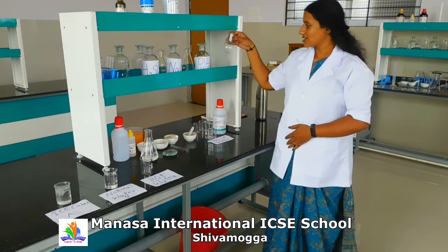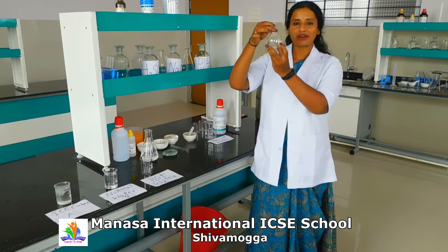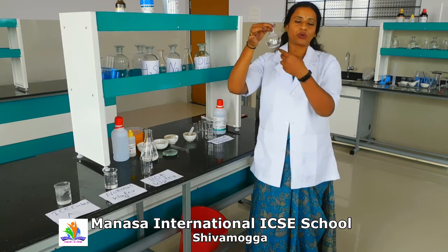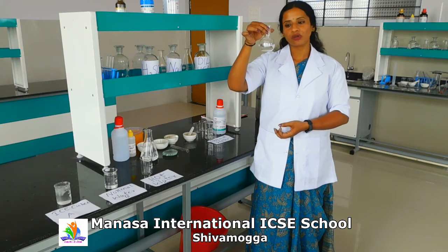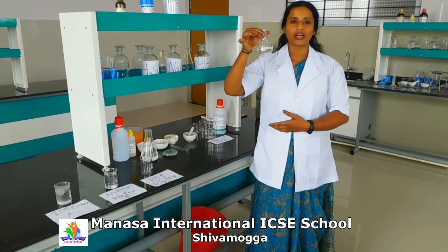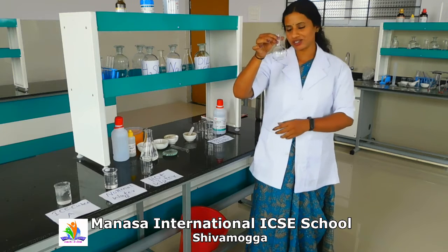So next this is called the round bottom flask, and its volume is 100 ml. Since it is round at the bottom, we have a neck at the top. This is used to conduct various experiments like reactions and also preparations. Not so much in reactions, but in preparations, some organic chemistry which you will come to know in your higher classes. This is what we call the round bottom flask.